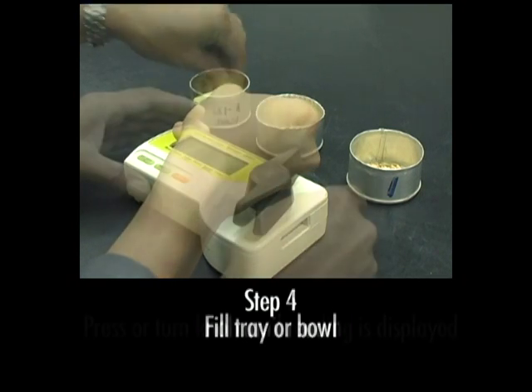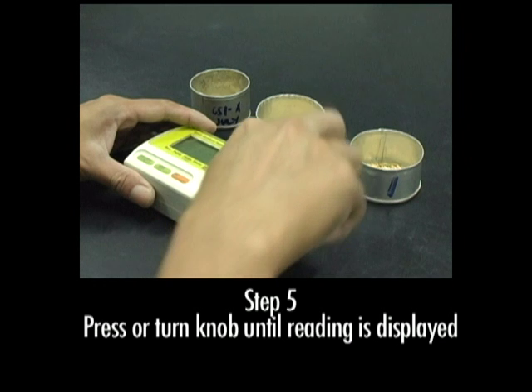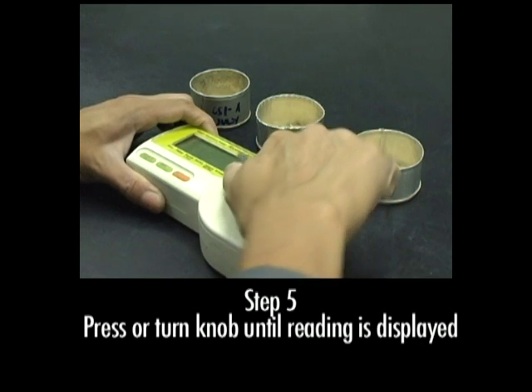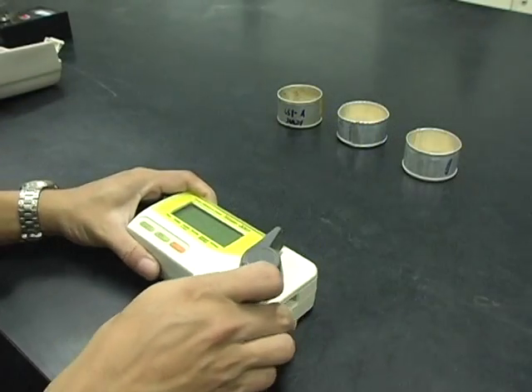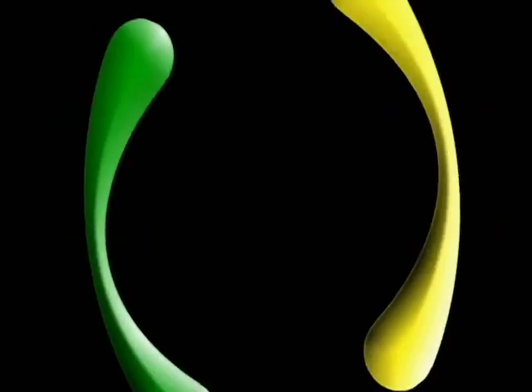Turn or press the knob until the moisture reading is displayed. It may take a little force, but make sure you turn the knob all the way as described in your manual, or you will get a wrong reading. Test at least 3 samples of the grain for an accurate moisture content reading.